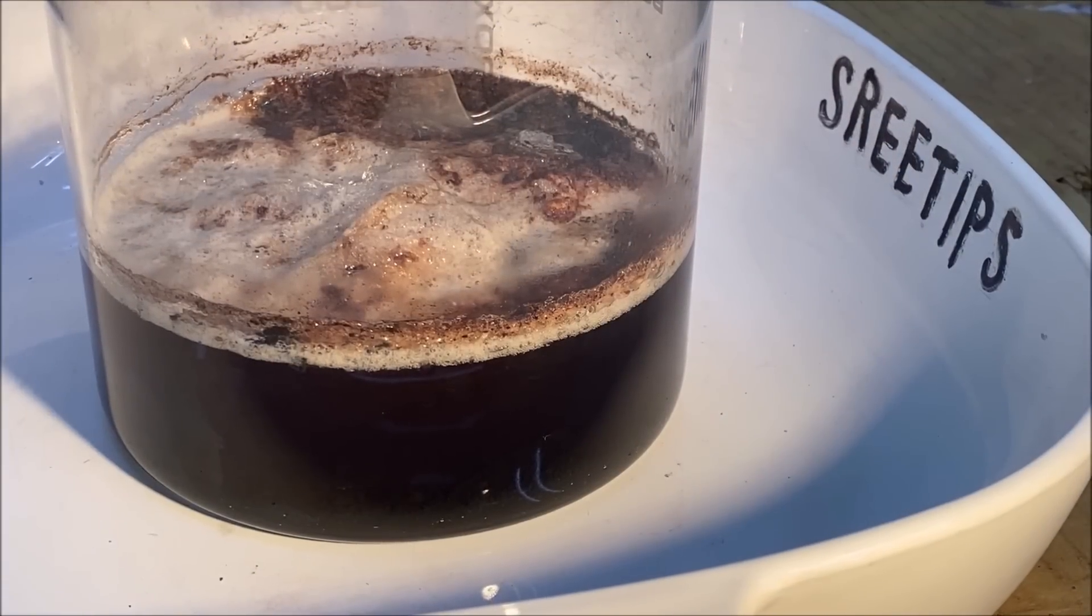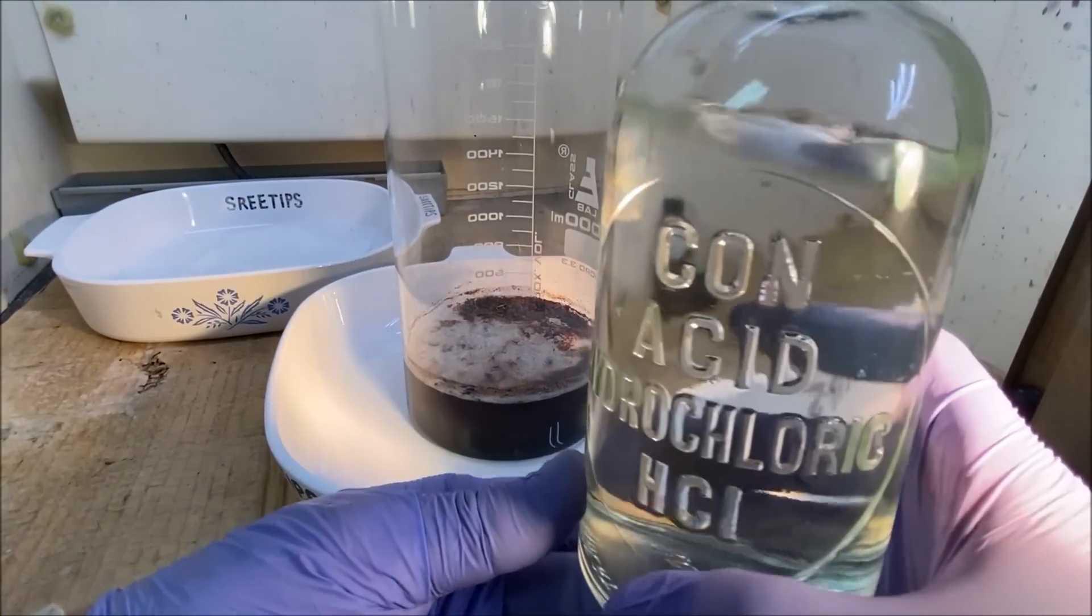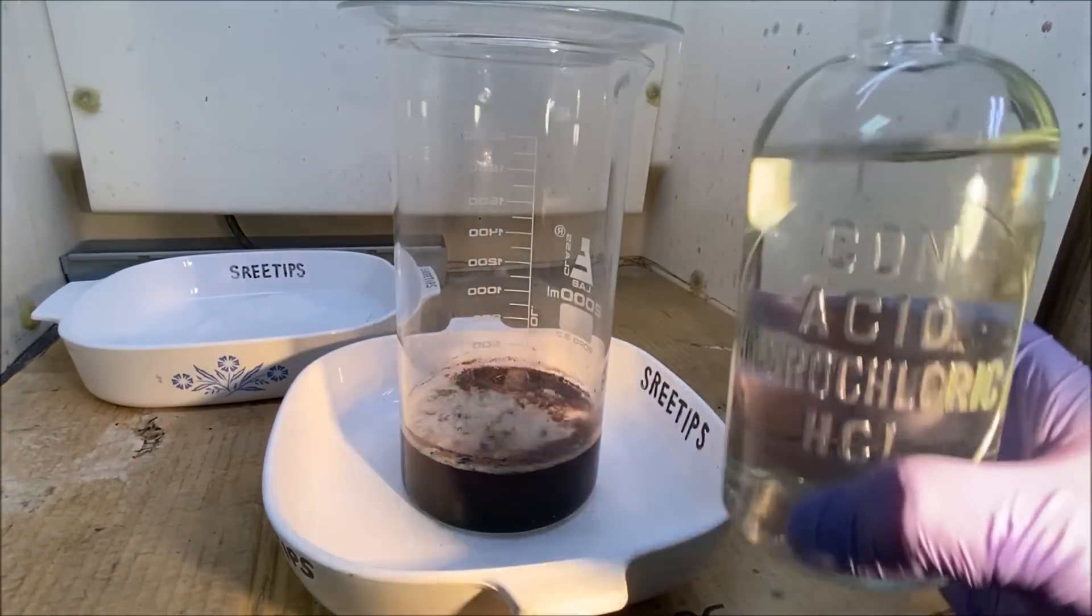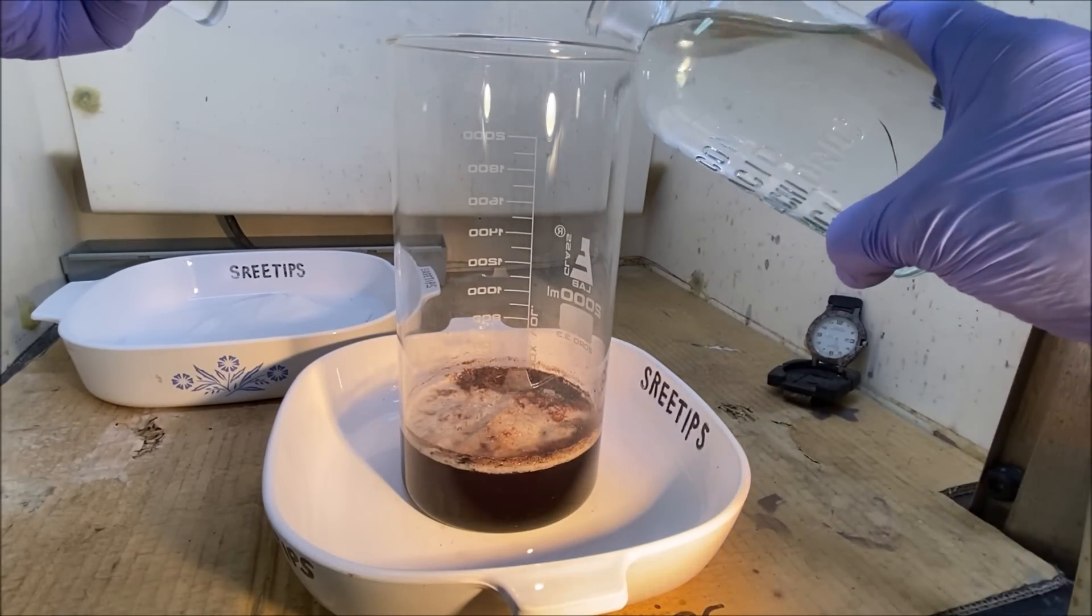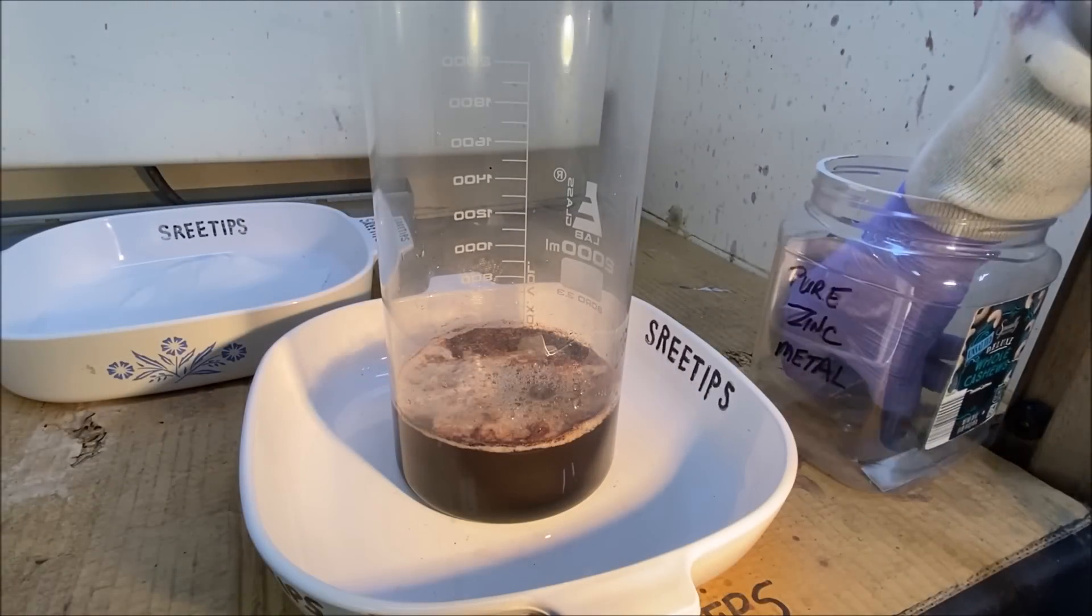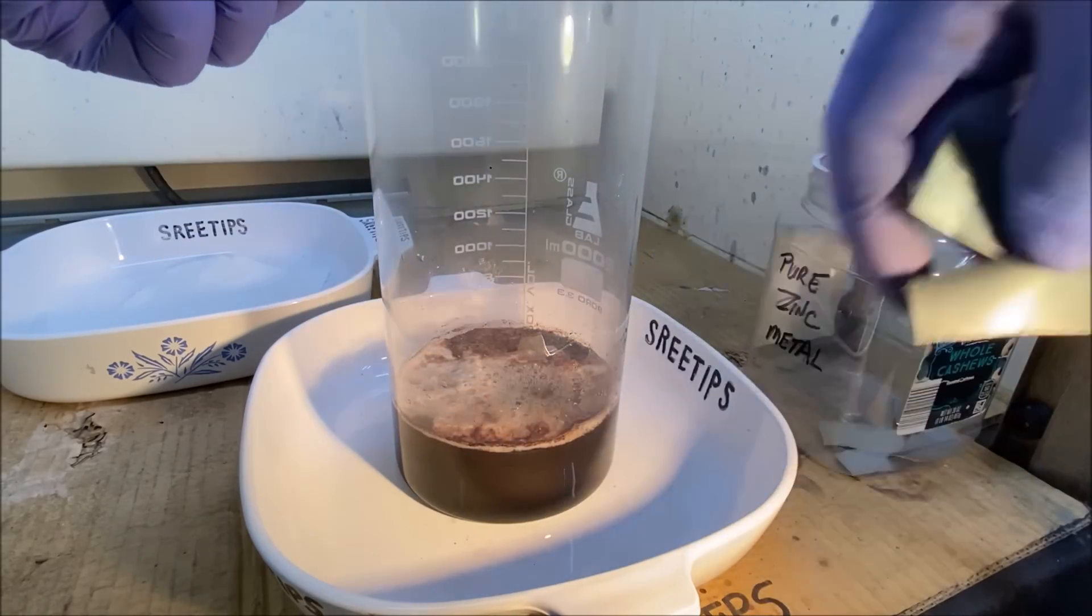First thing we want to do is add a little bit of hydrochloric acid to the solution. Not very much, just a little bit. Now I'll add a couple more pieces of zinc in here and get the rest of this solution to clear up.